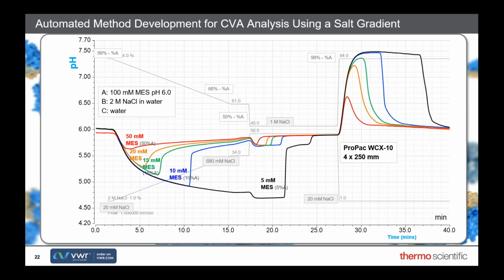once you've chosen to use your pH value. So the method we've been describing previously uses buffer blending with a strong buffer that controls the pH over a wide range. But actually, most methods published use only one buffer to cover the whole of the desired pH range. And here's an example of buffer blending using a buffer for pH 6.